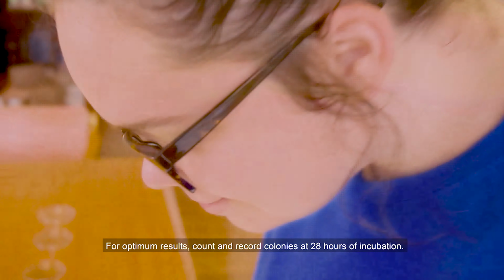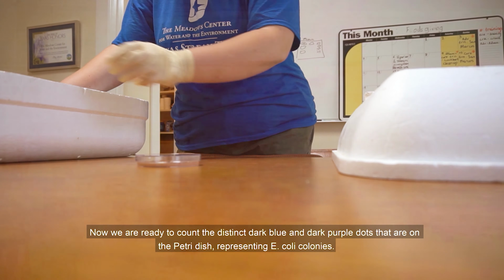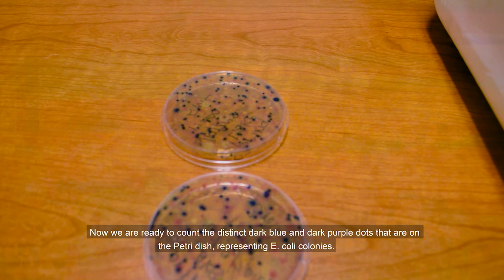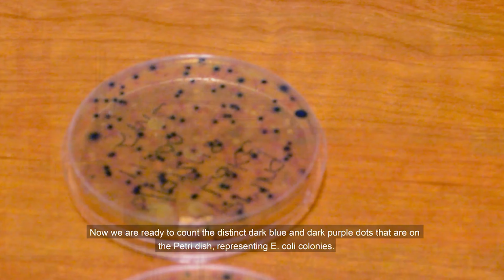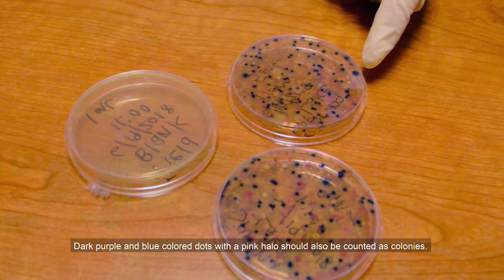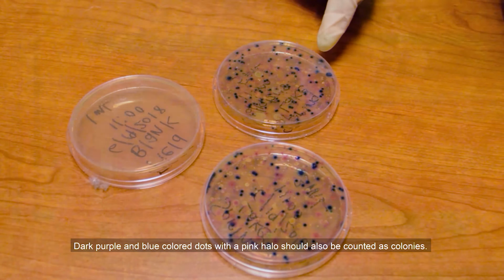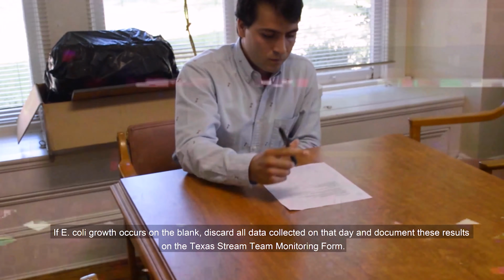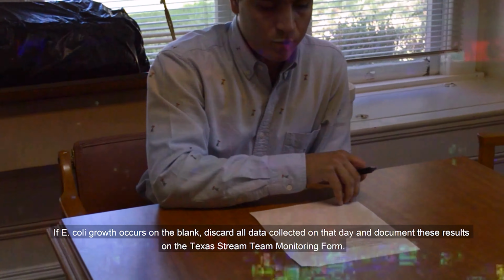After you have incubated the samples, take off the top of the incubator and remove the incubated petri dishes. Record the incubation time and temperature on the Texas Stream Team monitoring form. Now we are ready to count the distinct dark blue and dark purple dots that are on the petri dishes, representing E. coli colonies. Dark purple and blue colored dots with a pink halo should also be counted as colonies. If E. coli growth occurs on the blank, discard all data collected on that day and document the results on the Texas Stream Team monitoring form.